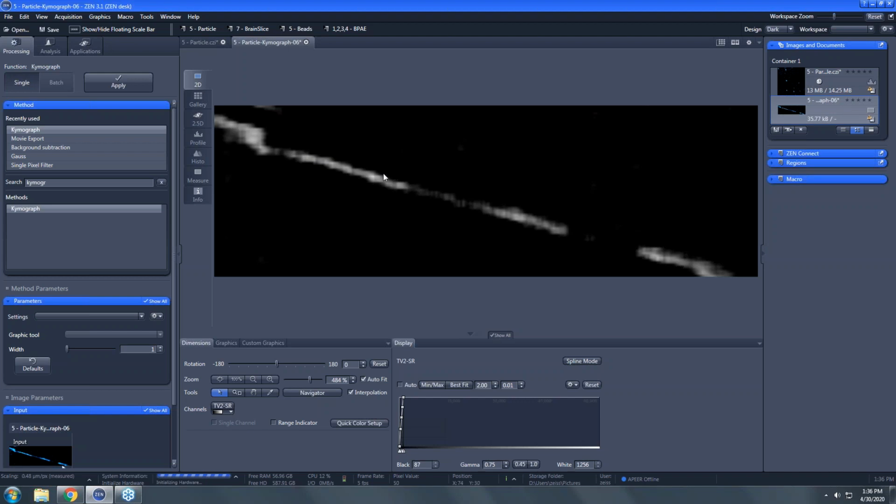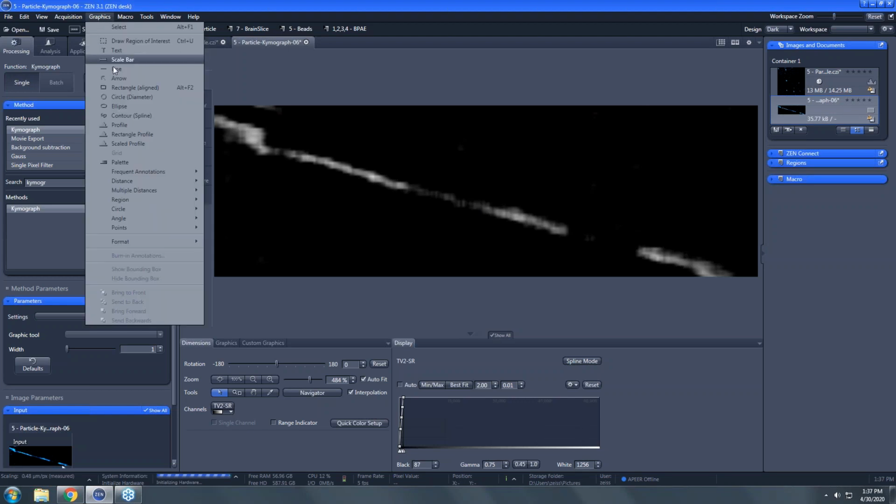Yeah, I mean, it's just the basic geometric equation that I'm sure we all know. Have to pull back in the memory, but yeah. Good. Terrific. And I should mention that there's an angle measurement tool under the graphics bar in the file menu. So if you wanted to do that, all the way at the bottom of the list there pretty much is the angle measurement.